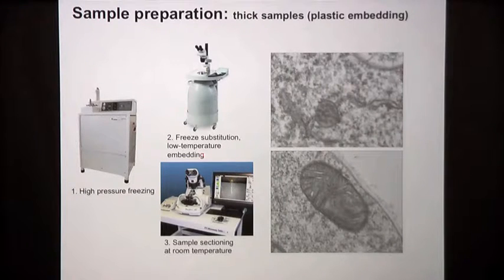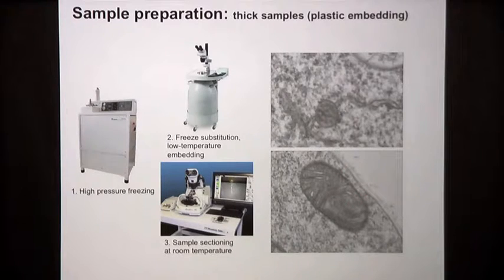One thing I would like to mention is that during the procedure, a contrasting agent often has to be added to see the ultrastructure details, and this contrasting agent could be uranyl acetate or something like that. So again, the density that we see is the density from the stain and not from our biological material. So even though we can see a large amount of detail in the ultrastructure, this is not a structural biology technique.